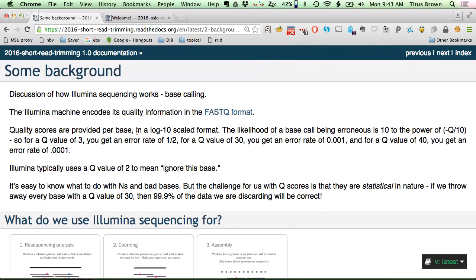And in doing so, it faces a number of challenges. One is that the signal intensity may diminish over time as there's more contamination or more dilution in of complementary bases in each DNA spot. The signal intensity will fall off with bleaching. There may be overlaps if you're looking at small colonies of DNA that are very close to each other, and an A and a G are added right next to each other.